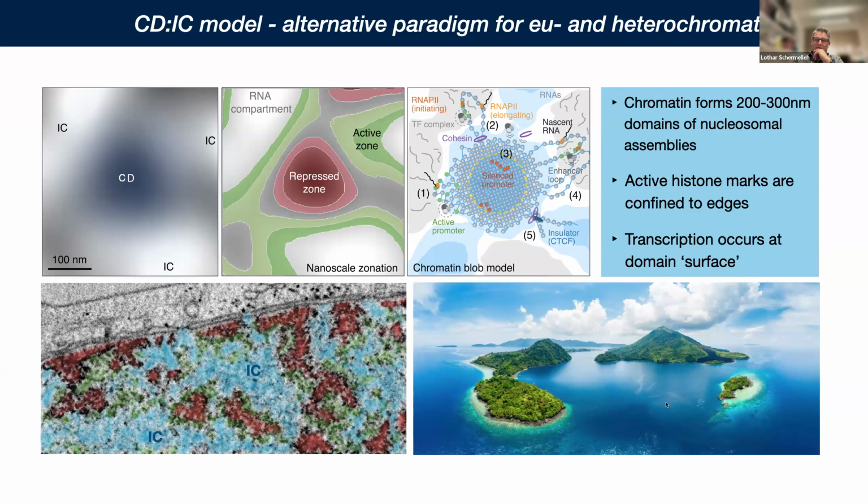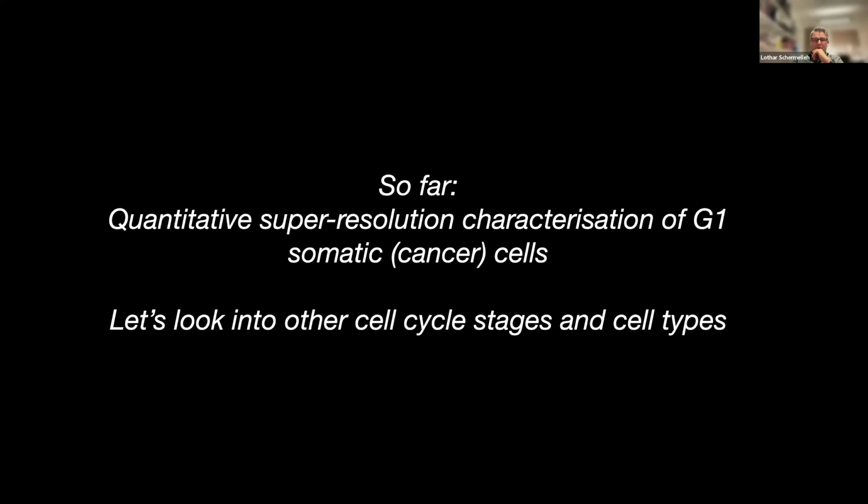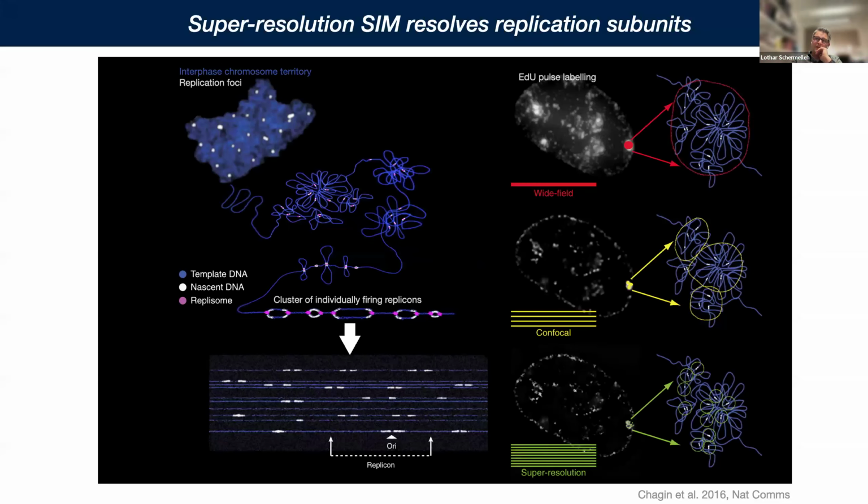So anyway, I'm mindful of the time, and I just want to make some mentions on that, the fact that we've only looked at a specific cell cycle stage, we're basically restricted to G1. But there is, of course, an interest in other cell cycle stages and other cell types.